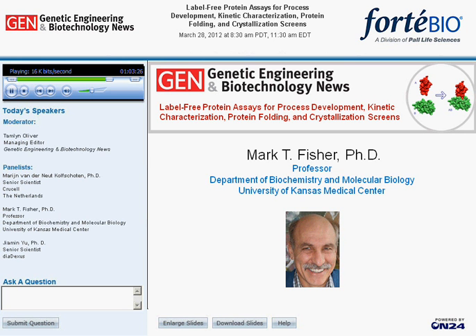So if you have a GST construct, for instance, one can position the protein away from the immobilized tip. That's one of the problems we had run into early on. If we just immobilized onto an NHS type tip surface, meaning a reactive surface, we would run into that problem. So we have to actually extend the protein from the tip surface.